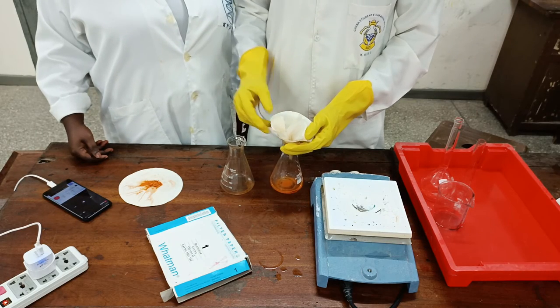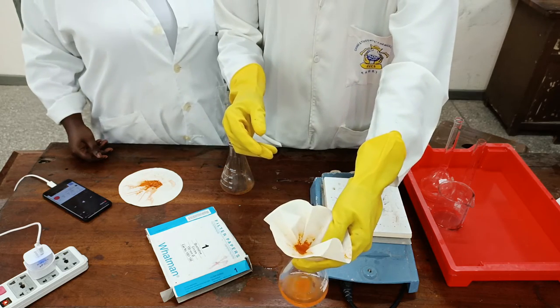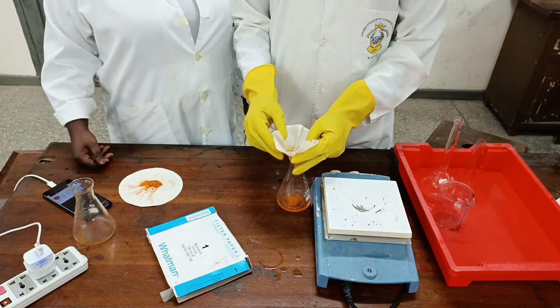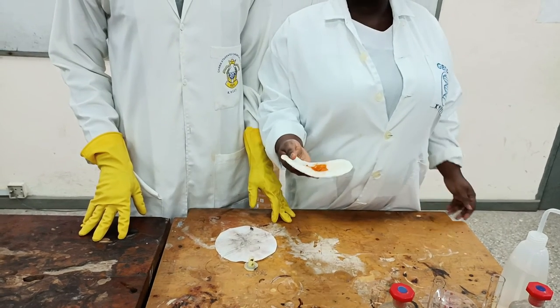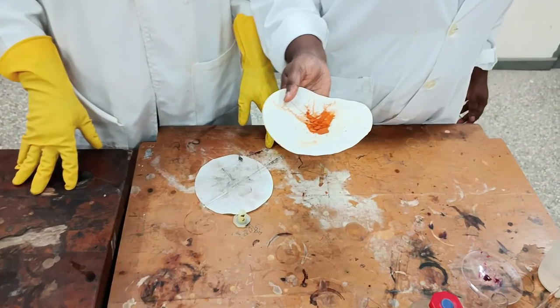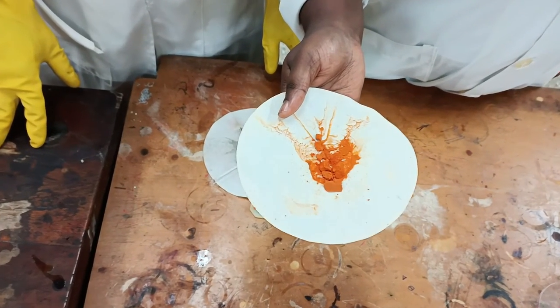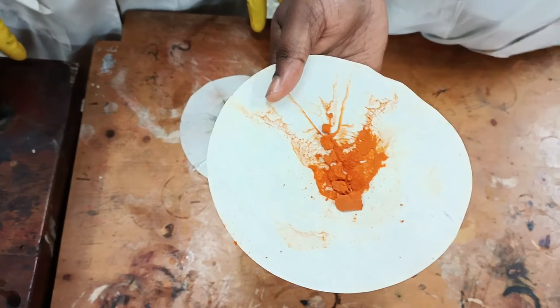Alright, so we filter, and as you can see, the crystals are formed here. Then we are now going to dry. Wonderful. So after drying our crystals, this is the end result. That's the color of the hexaammine cobalt 3 chloride. It's orange in color. So viewers, that is our crystal. It's very beautiful.